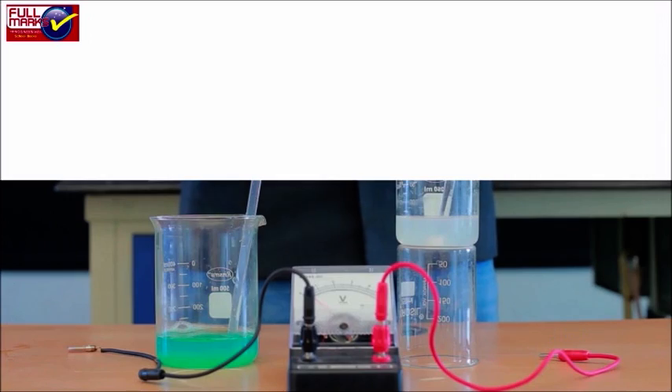Connect both beakers via KCl salt bridge and note down the voltmeter reading. Repeat the procedure with different concentrations of CuSO4 but same 1M concentration of ZnSO4.